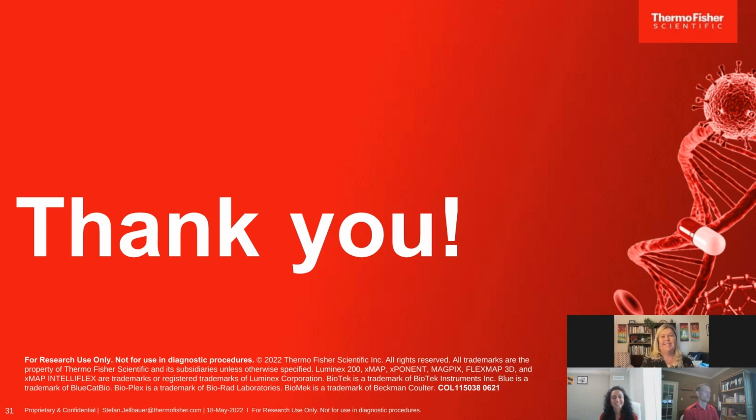Yes, it does. Thank you so much. Now, you listed a number of instruments placed on the Inspire platform. Is it possible to use different instruments than the ones that were mentioned? For example, using a different plate reader or a plate sealer or peeler?